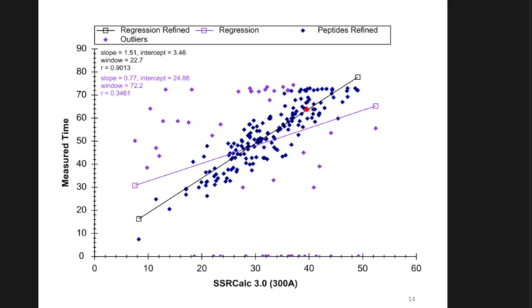There might be a large signal coming out in that region of your chromatogram at 70-something minutes. And so if it were me, the first thing I would do is I would politely minimize Skyline and go to whatever raw file viewer I have to see what the TIC looks like. And the reason is because I want to see what's happening right there. That's making Skyline think that's a whole bunch of peptides that really aren't there, right?